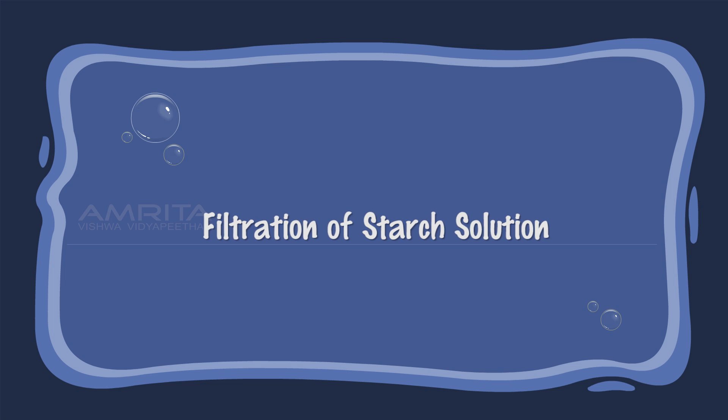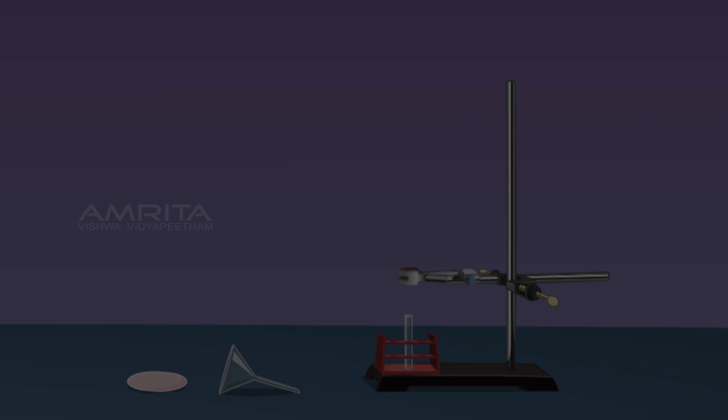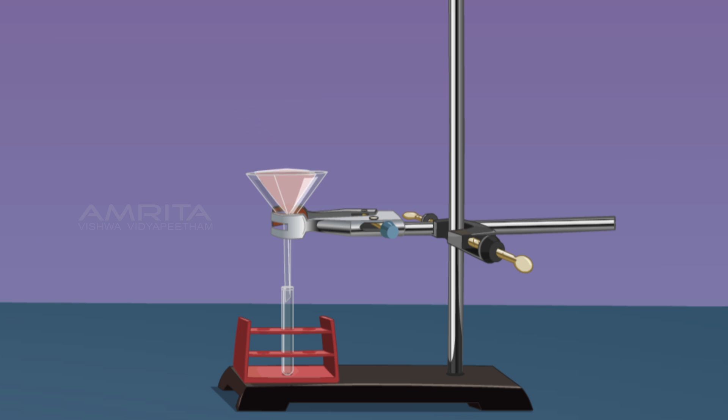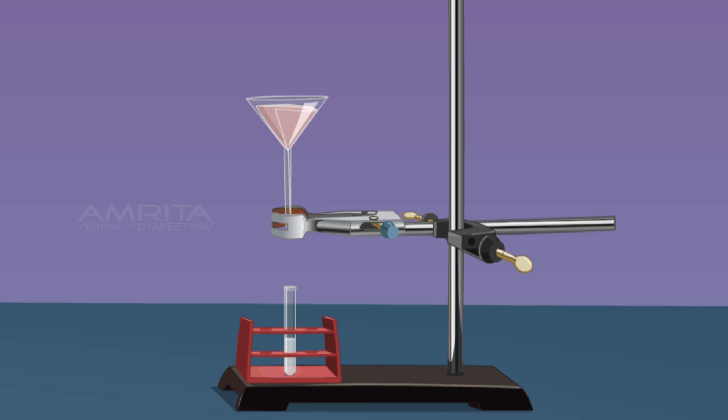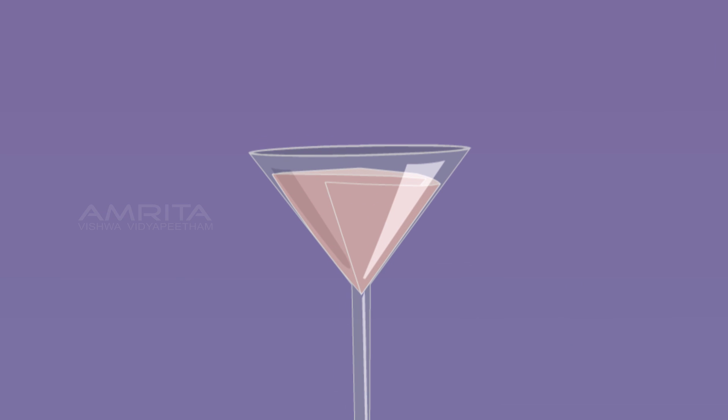Filtration of Starch Solution: Place a funnel over a test tube using a clamp stand, then place a filter paper in the funnel. Now pour the colloidal starch solution through the funnel. A translucent filtrate is obtained with no residue left on the filter paper. This indicates that components of a colloid cannot be separated by filtration.